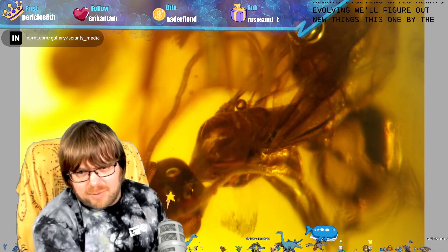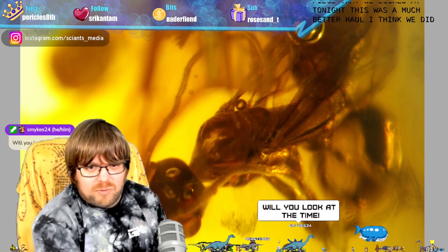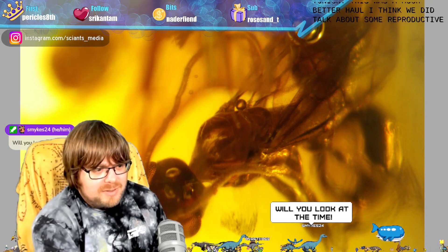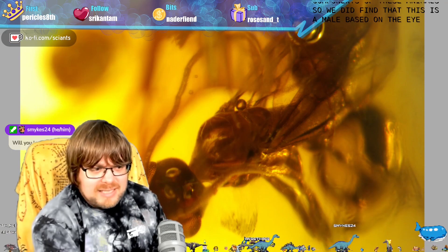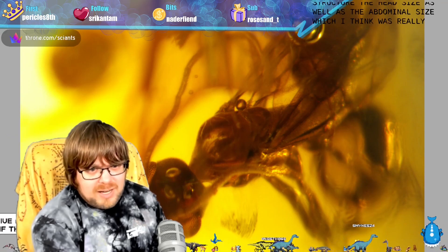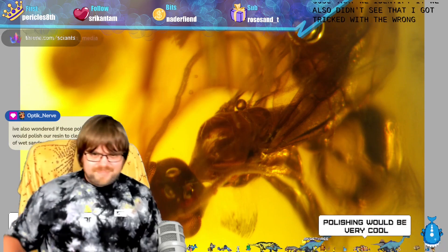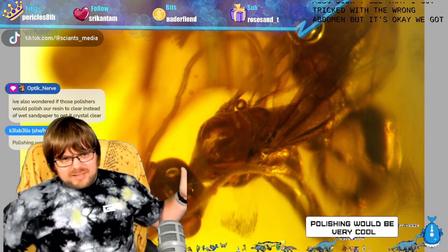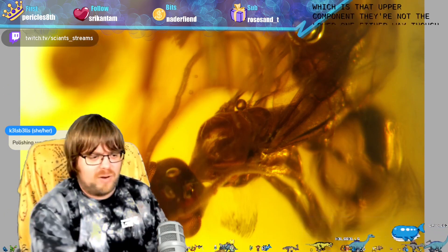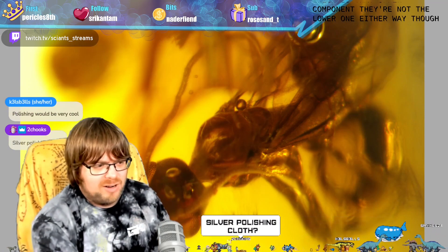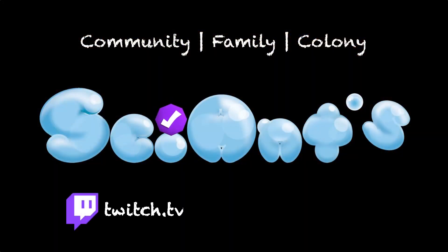This was the other amber piece we looked at tonight and it was a much better haul. We found this is a male based on the eye structure, the head size, and the abdominal size - which was really cool to identify. I did get tricked by the wrong abdomen, but we got the right one in the end - that upper component, not the lower one. Either way it's too small, so it's most likely a male rather than a female.